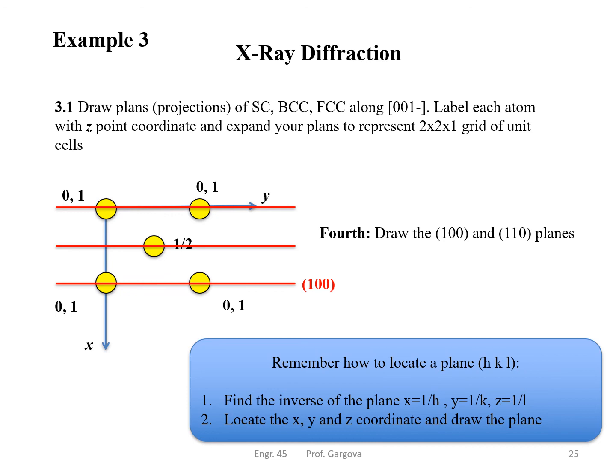We see that the distances between the planes are about 1/2, which can affect the way that the n lambda is not an integer. So this can lead to interference, and thus deconstructive interactions between the incoming waves and the reflected waves, leading to no diffraction pattern.